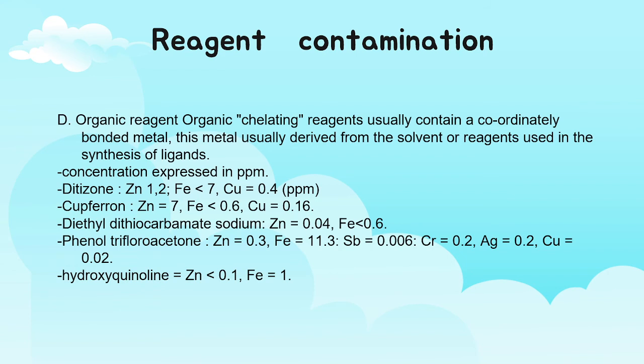Hydroxyquinoline: Zn less than 0.1, Fe equal to 1.